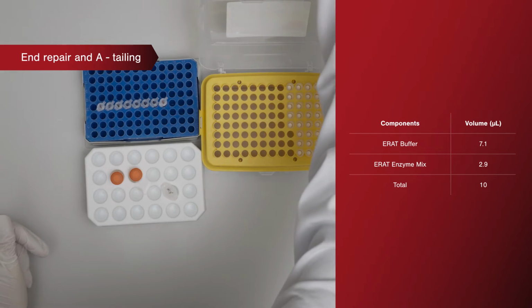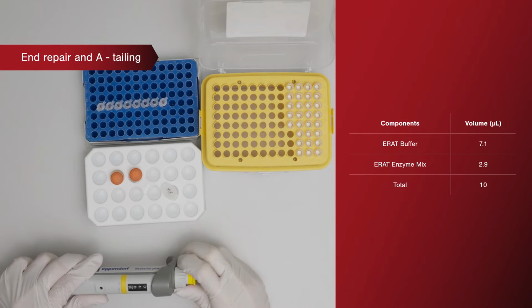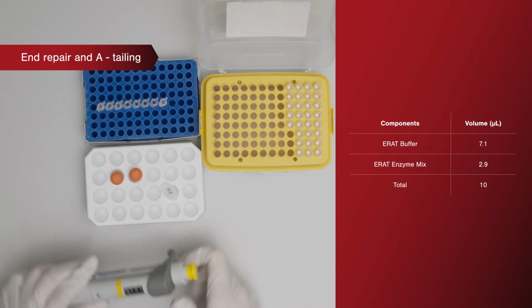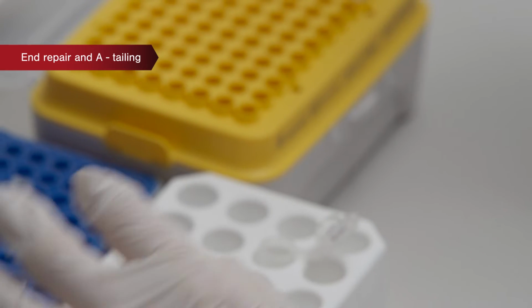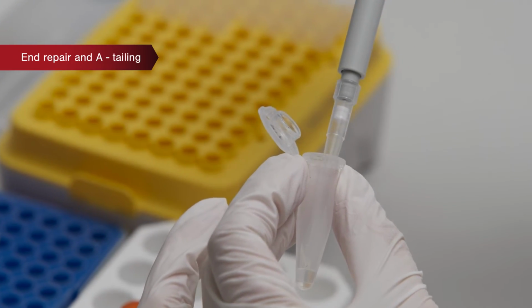Mix it thoroughly, and then 10 microliters of ERAT mix are added to each of the samples. The volume on how to prepare the ERAT mix is shown in Table 3. From this step forward, when adding reagent to the samples, enzymes and samples need to be placed on ice, except for bead cleanups.